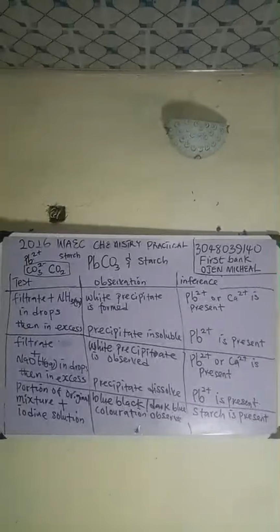Yes, a mixture with this, you add starch. That is our first step. That one they cannot ask you to use to do your test of starch.